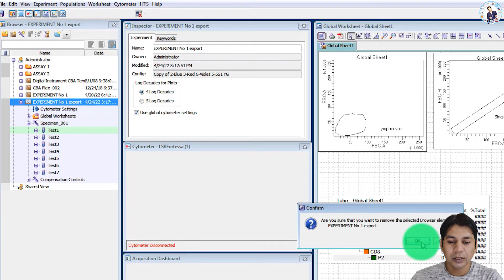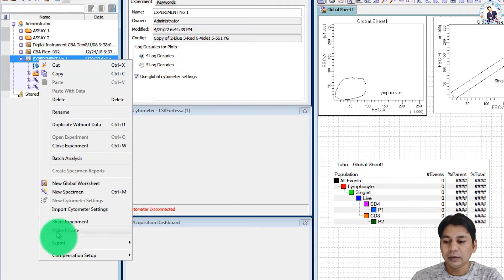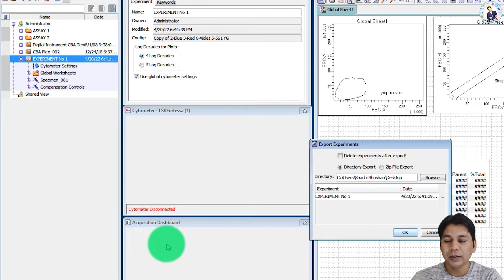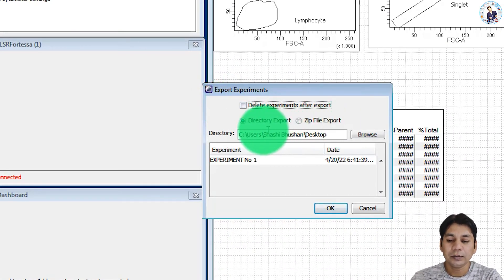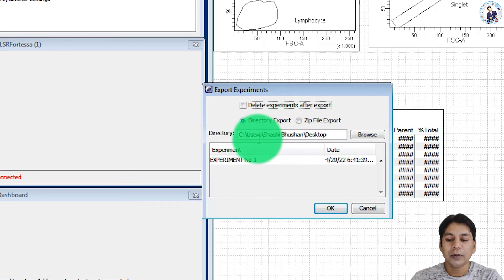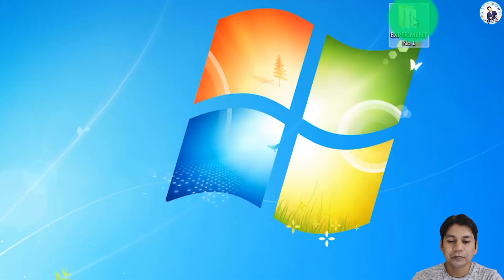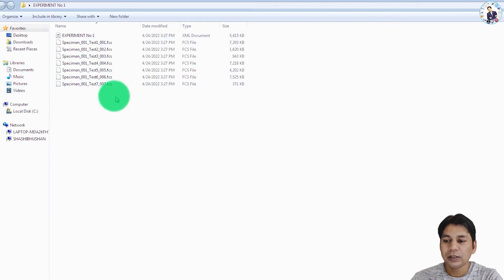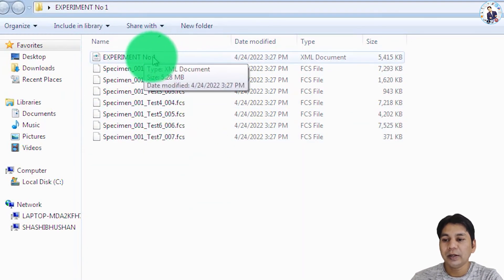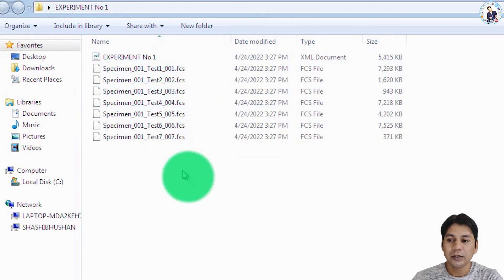To export the full experiment with data, right-click on the experiment, select Export, then click on Experiment. Here you will see some options: export experiment settings, and 'delete experiment after export' — if you want to delete it after export you can check that box, but I am leaving it unchecked. You can also choose between directory export and zip file export, and select the directory where you want to export. Click OK. You can see experiment number one is exported, containing all seven data files and the XML template file.